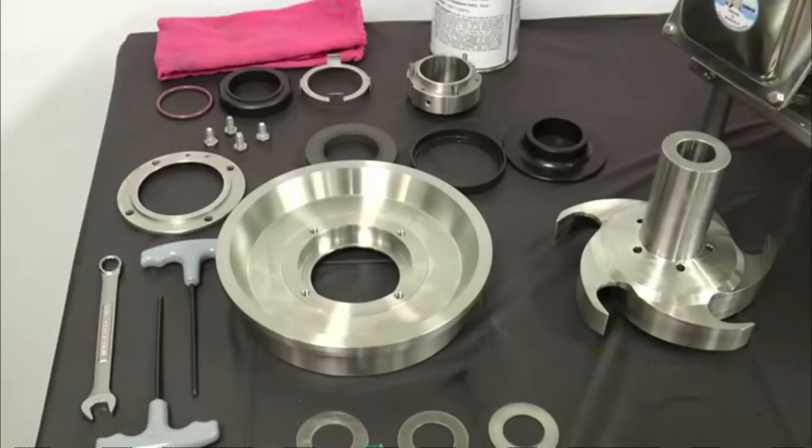Once disassembly is complete, perform the following inspections. Examine all seal surfaces and replace seals that are scratched, cracked, and or brazed.